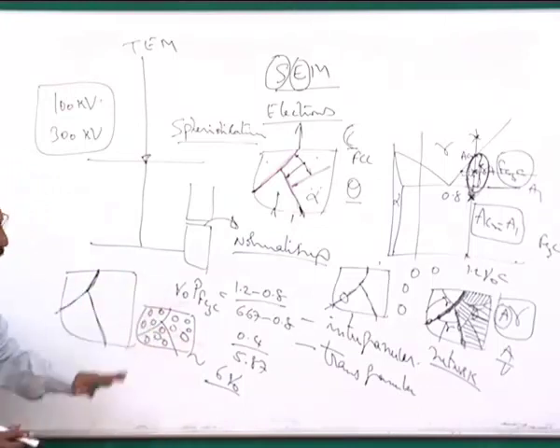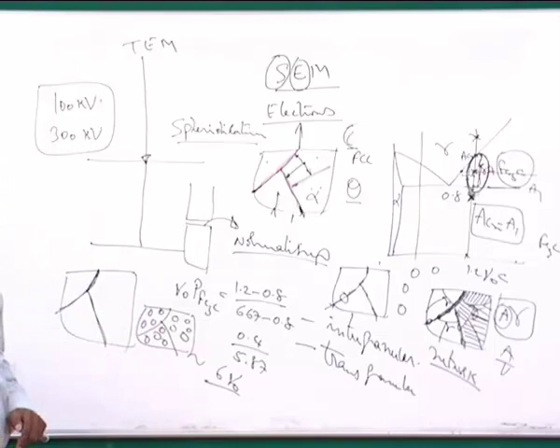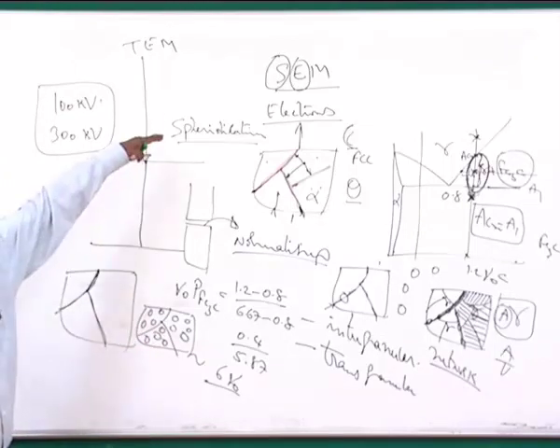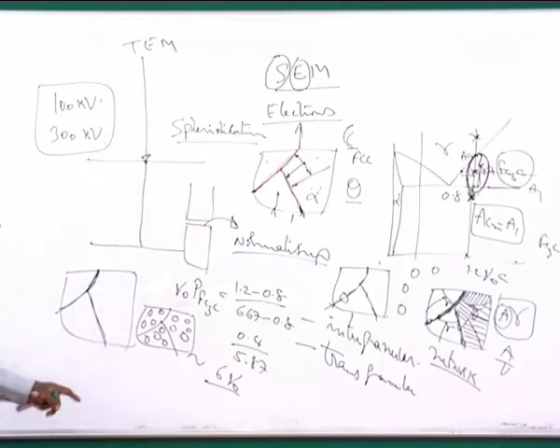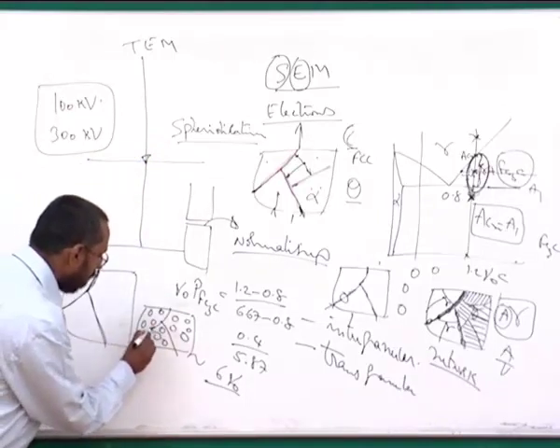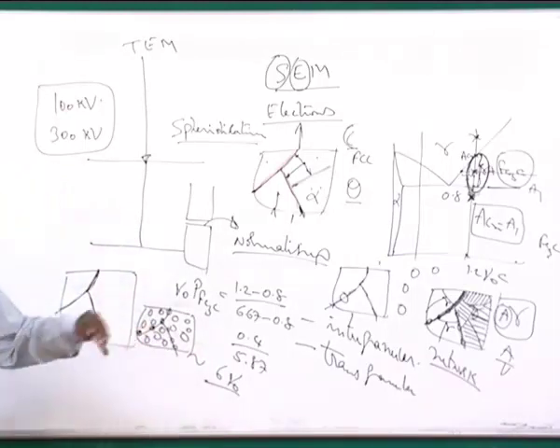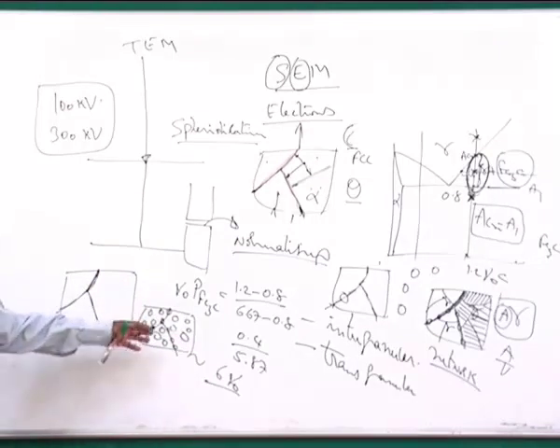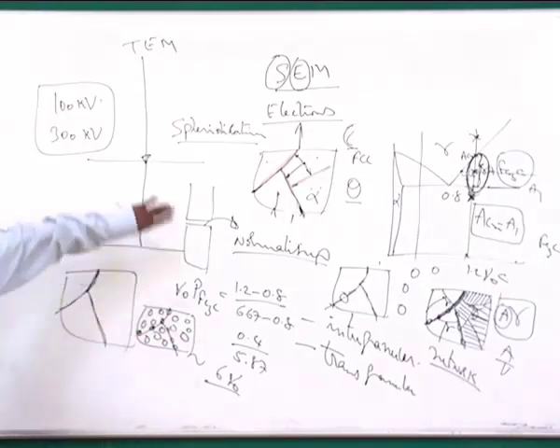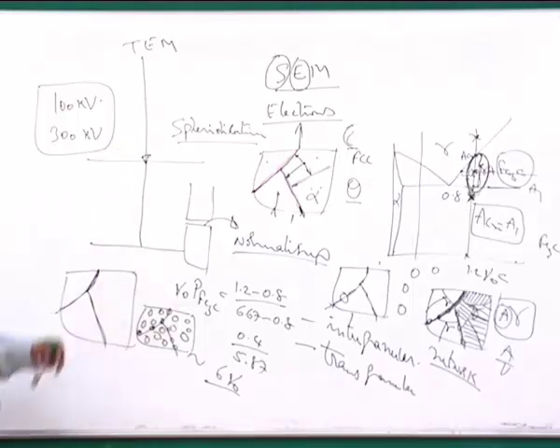So you will have a ferrite matrix and cementite particles in the matrix, and such a microstructure is what we call a completely spheroidized microstructure, where not only the grain boundary particles of cementite are converted, but also the cementite inside the pearlite. Hence you will have a structure which is completely ferrite with spherical cementite particles, and you can achieve very high ductility in such a material.